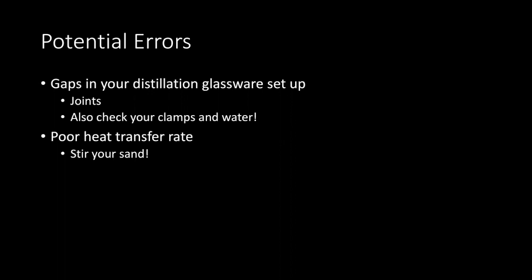The other big error and also time suck for this lab is a poor heat transfer rate. Sand will transfer heat. It does it fairly slowly. So get your glass stirring rods out. Do not use a metal spatula, but get your glass stirring rods out and stir your sand. Don't stir it so violently that you have a lot of sand to clean up at the end of the day, but be sure to stir your sand so that the hot sand gets moved from the bottom up towards the glassware. Honestly, you'll be surprised at what stirring your sand will do in terms of giving you a more even heat transfer rate and also speeding up your distillation.